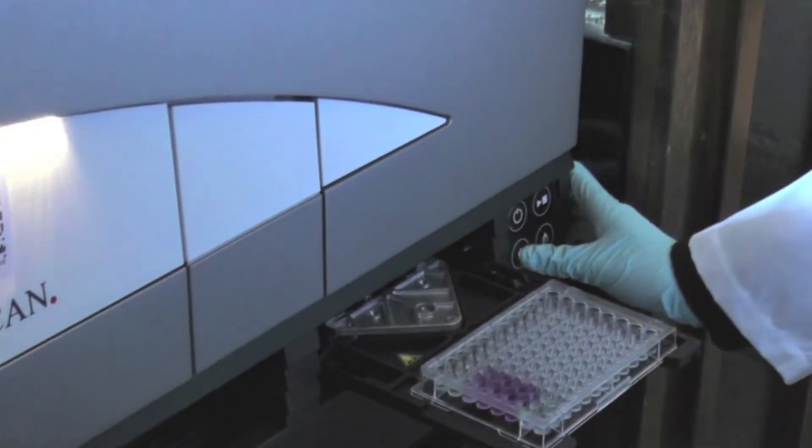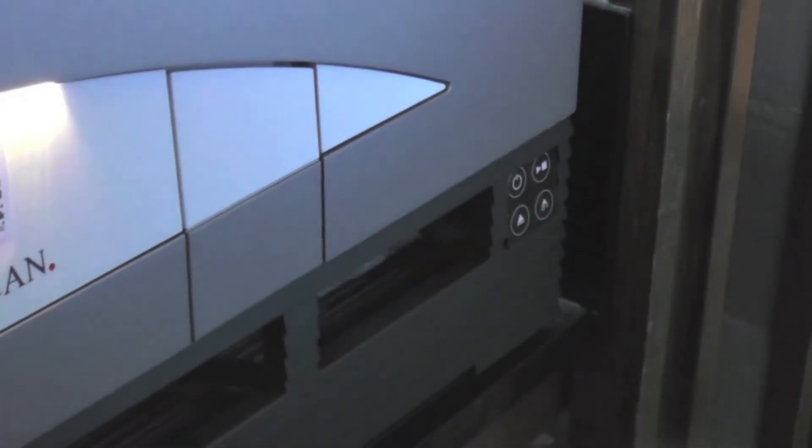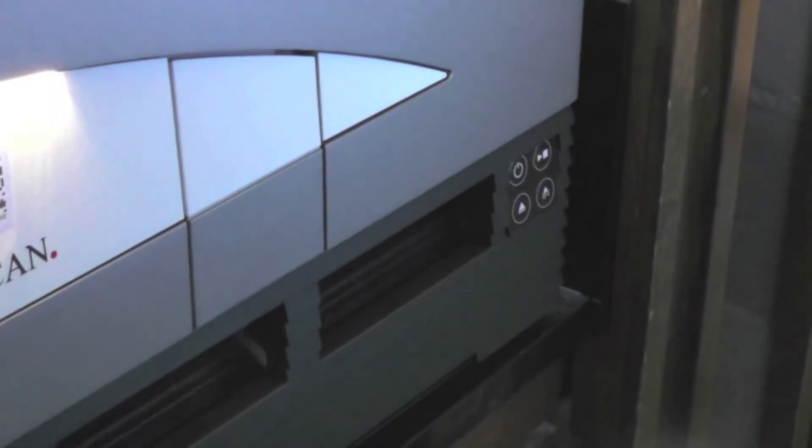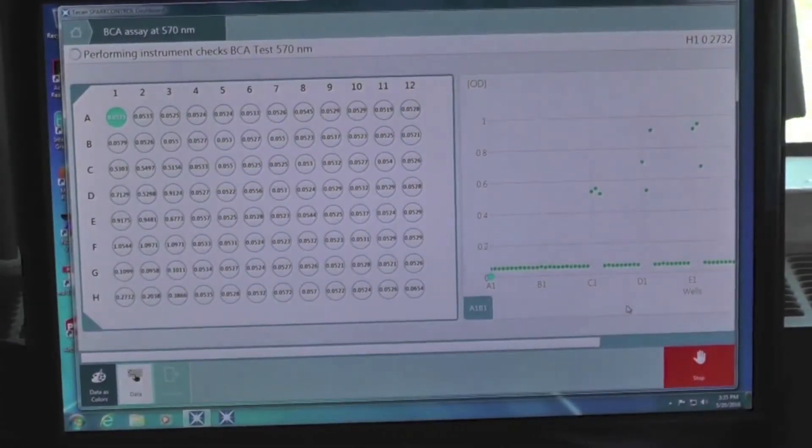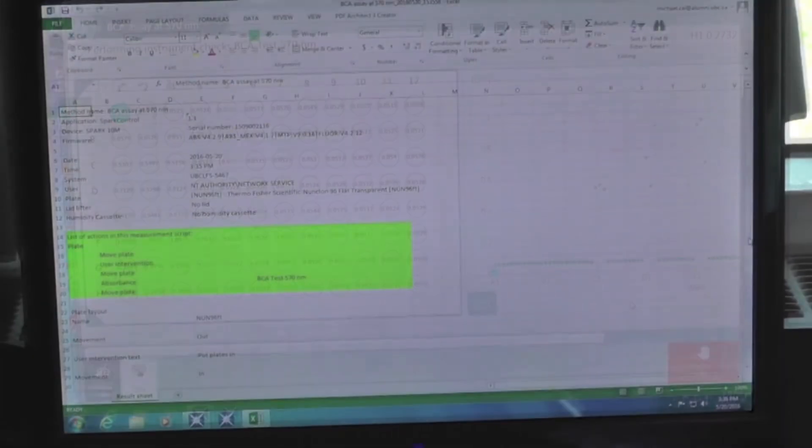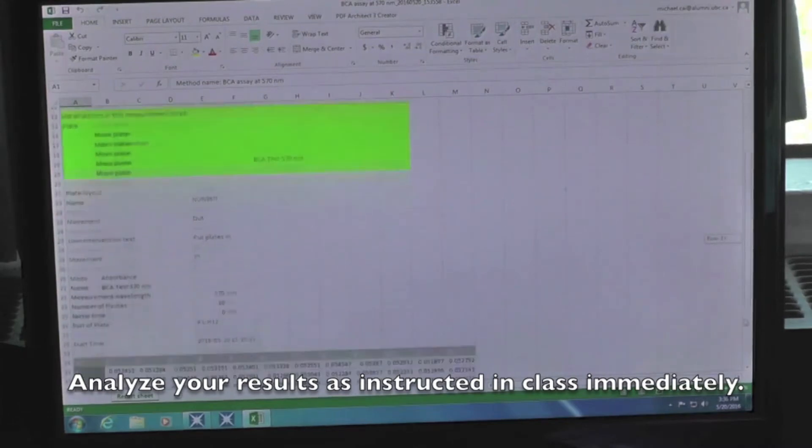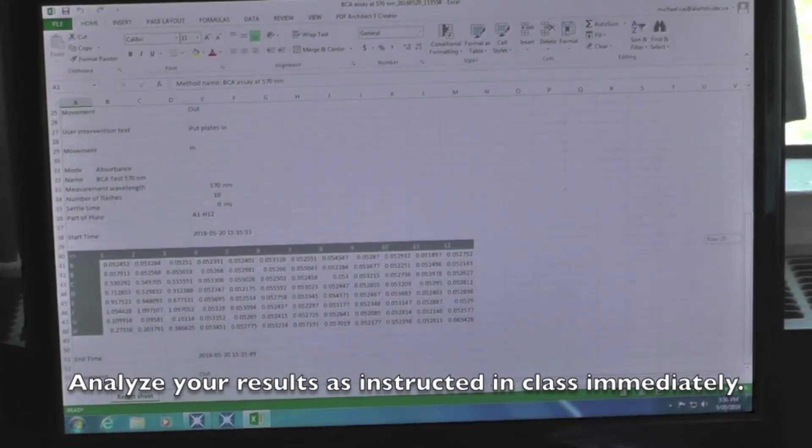Perform the BCA protein assay as outlined in session 4 and demonstrated in the BCA protein assay video. Read your plate with the tecan spectrophotometer. Analyze your results immediately with the computer to determine the protein concentration of your sample, then verify with your TA.